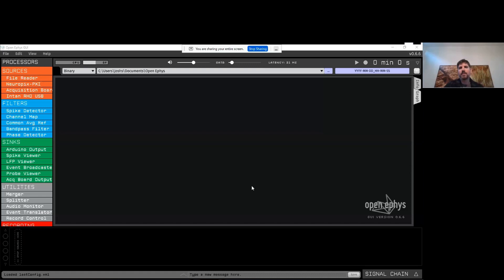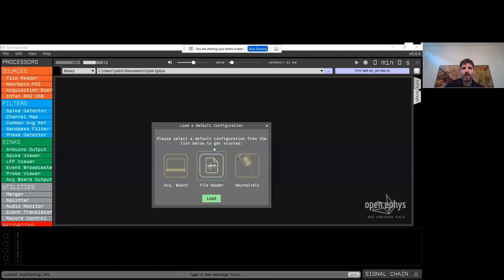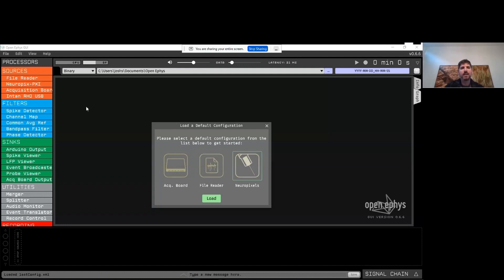When you first open up the software for the first time, you will see a pop-up window that allows you to select a default configuration. This is an easy way to get up and running with different types of signal chains. In this case, we're going to select the Neuropixels plugin, and if you're running this for the first time, that would download the Neuropixels PXI plugin into your processor list and then load the recommended configuration for recording from Neuropixels.